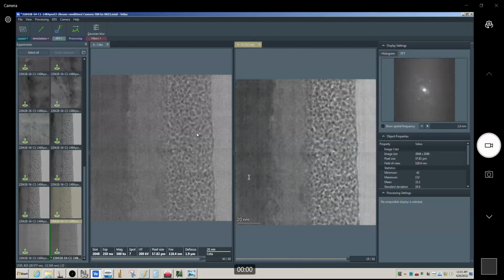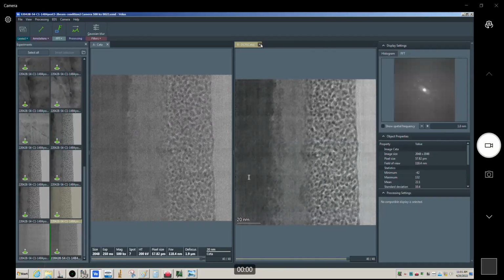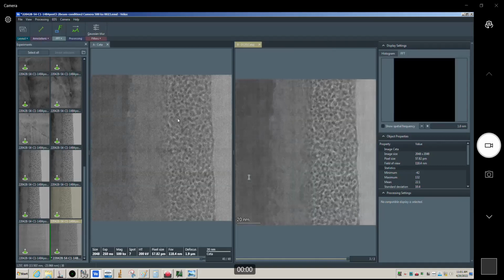Oh yeah, you can see it in the FFT when you're seeing this kind of rippling stuff. That's not good. That means it's not aligning the frames properly. Why is it doing that? Interesting. The final signal to noise looks reasonable, but all right, let me try it one more time. Let me try it with regular DCFI, because maybe that'll work better since the signal's not as high here.